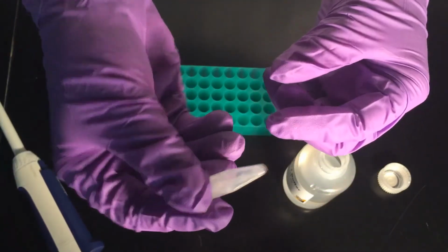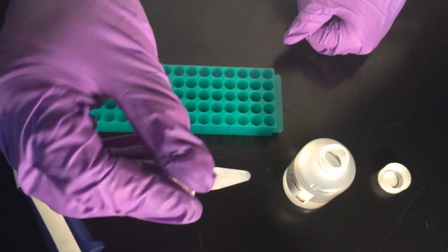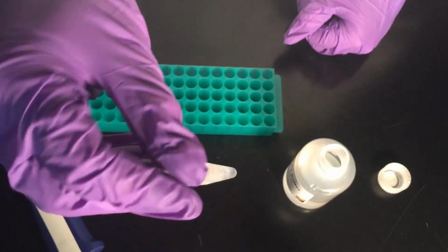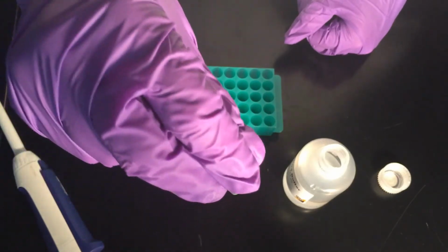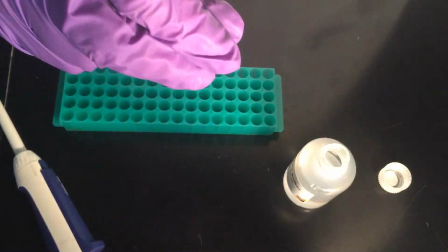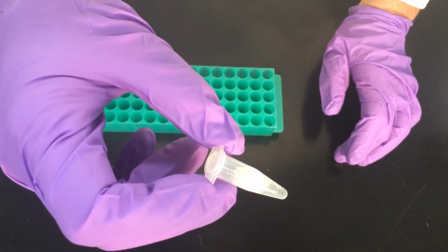So there we go. I'm just going to mix it up a little bit. Maybe you can see it's already getting a little bit cloudy, and that's the precipitation of the proteins and the genomic DNA. So like I said, I'm going to let that incubate on ice for 5 minutes. So there's the tube after it's been incubated for 5 minutes. You can see all the precipitate in there.